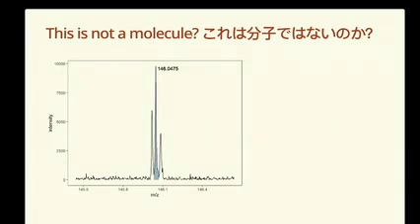they have some truth. Without the chromatographic separation, which is inherent to AIMS and DIMS applicabilities, it's very difficult to annotate features. But what I hope to accomplish in this talk is show you that we shouldn't be content with not knowing at all what a compound is, and that there's more truth to be uncovered in the raw spectral data, and that we can at least narrow it down very much from a very complex sample with maybe a few thousand features, and that we can at least generate some hypotheses to then drive more traditional LCMS, GCMS workflows to further dive into what might be at cause for example, a particular health profile.